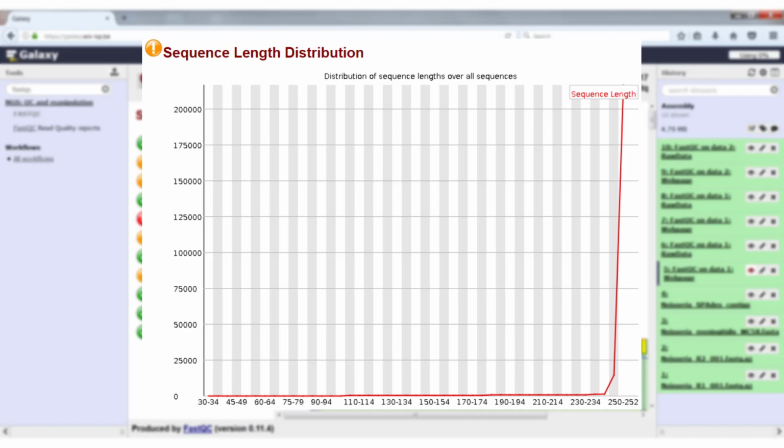If you would see a bump in the left part of the graph, it would mean that there were a lot of reads that did not extend to the maximum read length. The small area under the curve here is created by the fact that the Nextera XT kit also creates fragments that are shorter than the maximum read length. Therefore, it does not indicate a problem with the sequencer, it just means that the fragment could not be sequenced any further as it was not long enough.